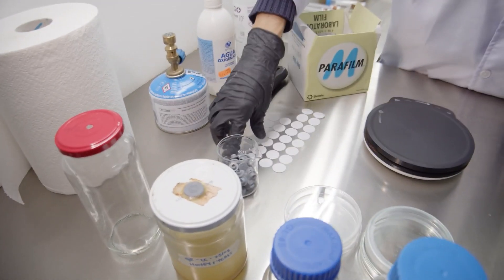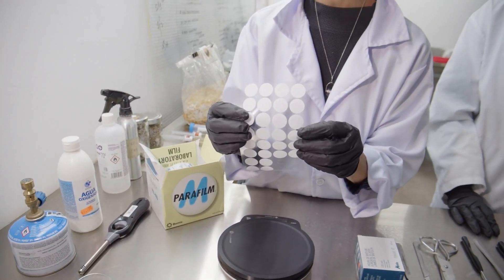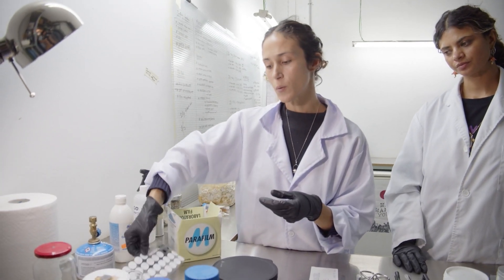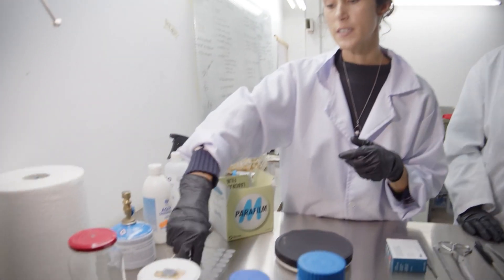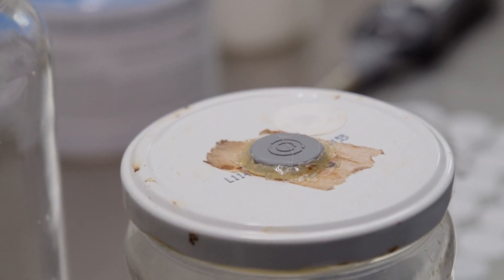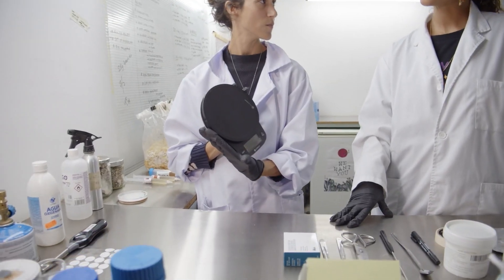If it fits your practice, you'll need either polyfill or — preferably — micron filter stickers. Rather than using polyfill, which is essentially synthetic microplastic, these little filter stickers allow oxygen exchange to happen inside the jar. Self-healing rubber ports can also be purchased and allow sterile liquid culture transfers — when you pull out the syringe, it seals right back up on its own.